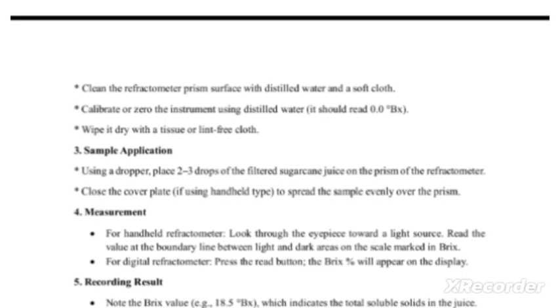Precautions: ensure no bubble or pulp are present in the sample. Maintain standard temperature. Use temperature correction if needed. Calibrate the refractometer daily for accuracy. Always clean the prism after each use to prevent cross contamination.